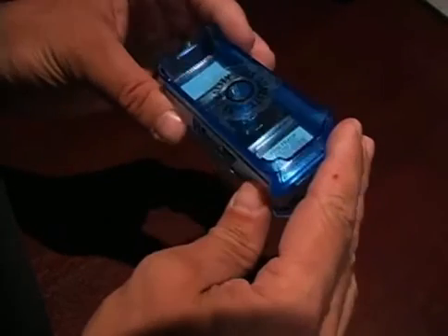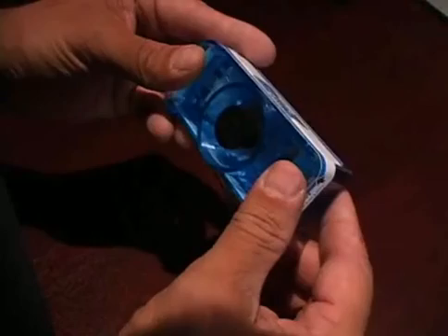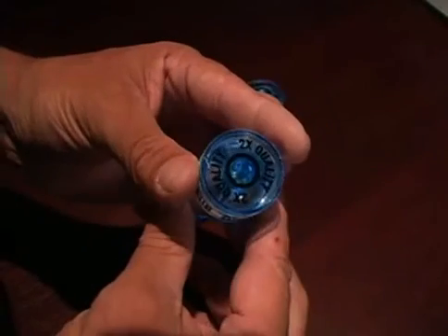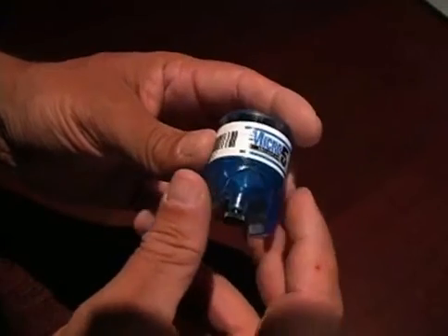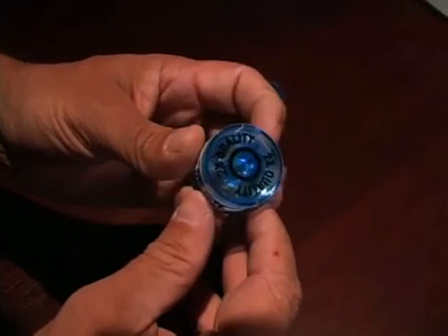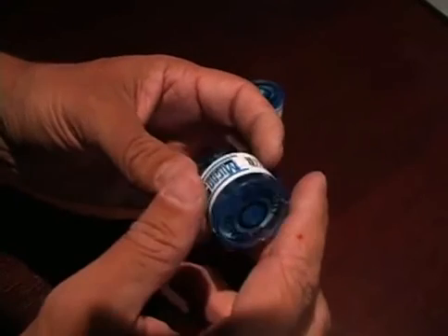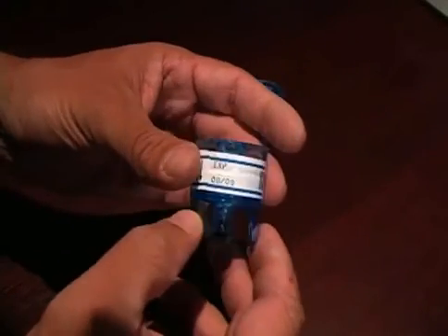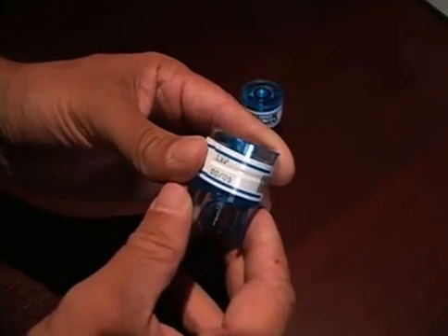The Micro 5, it utilizes a 360 degree impaction chamber inside. It collects aeroallergens such as pollens, mold and fungal spores, fibers, dander, insect components, parts, other airborne contaminants. It's designed to operate at a flow rate of 5 liters per minute.